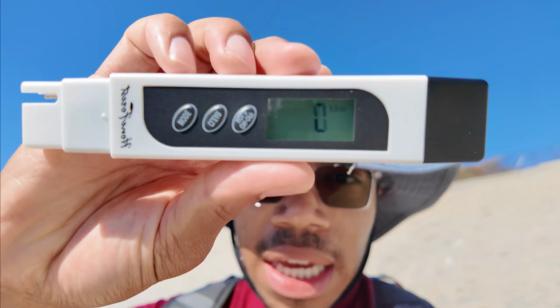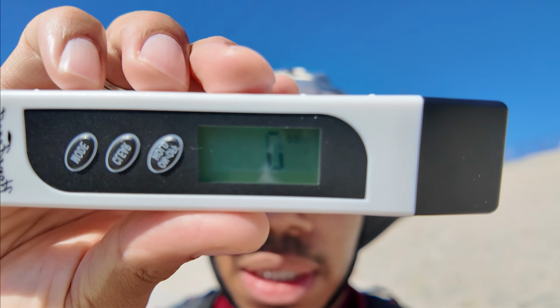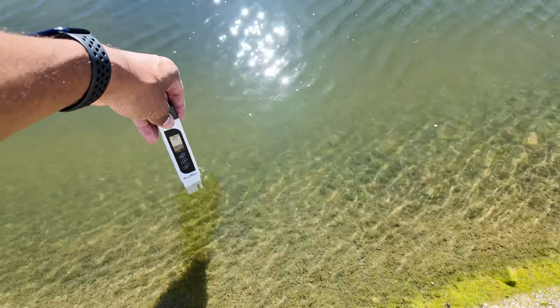So to get started, you can see that we have a TDS value of 0. And to take the measurement, we simply just dip the probe in the river and wait a few seconds for the number to stabilize and we will have our reading. Let me show you.